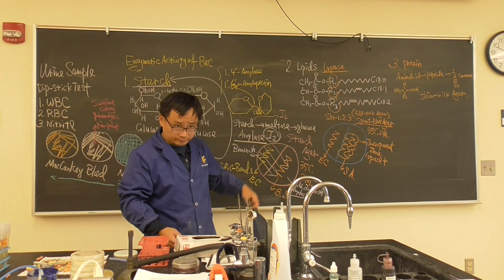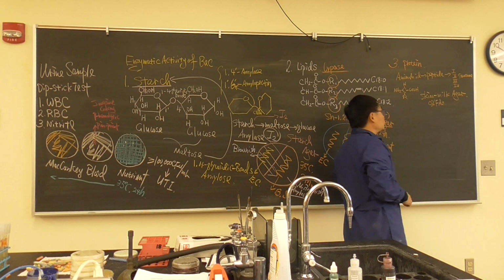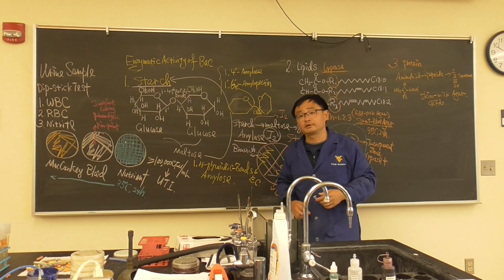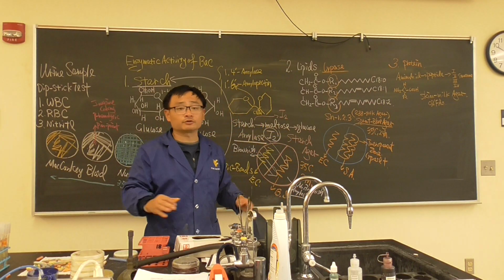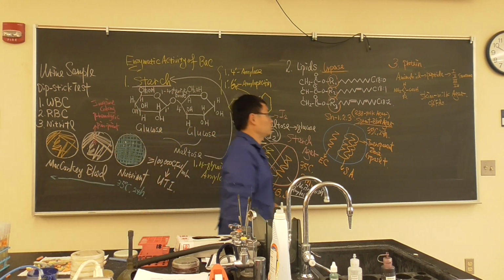What do you mean, skim milk? Theoretically, it is 0% fatty acids, so we take out all the fatty acids. Now, what's the sugar in milk? It's lactose, but bacteria won't use lactose. Okay, so skim milk agar is a good material.